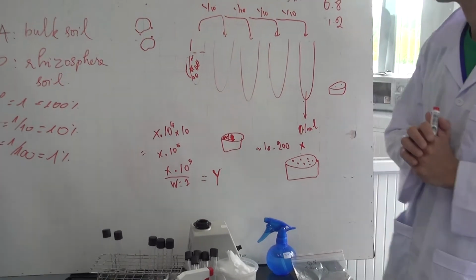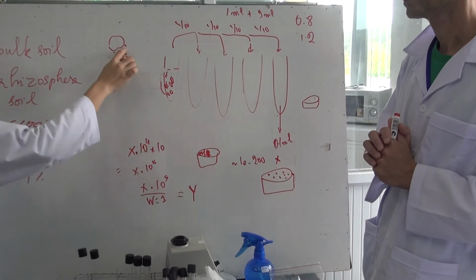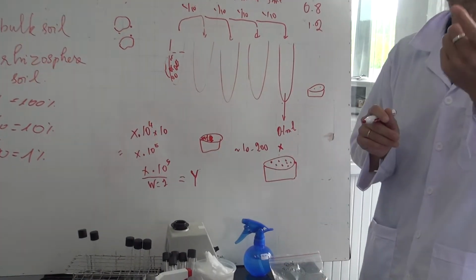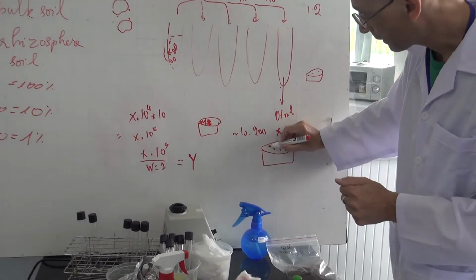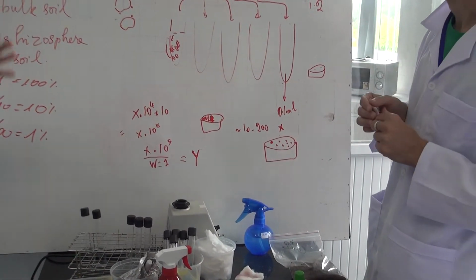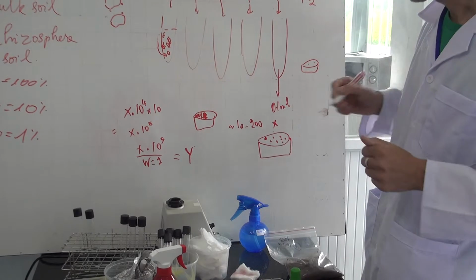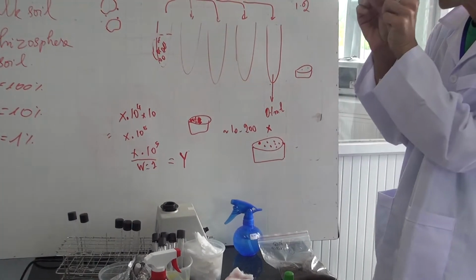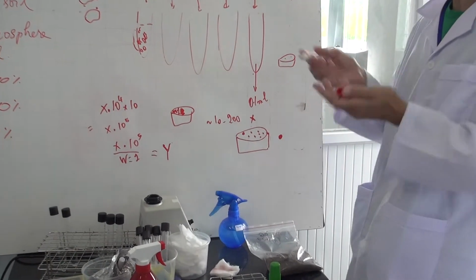Tại vì cái khuẩn lạc ban đầu mình chỉ giả sử là một khuẩn lạc thì có nghĩa là nó bắt nguồn từ một tế bào đơn, chứ không có nghĩa là một cái khuẩn lạc thì sẽ có một tế bào. But in reality, we know that sometimes the colony does not come from one cell, but from a number of cells that stuck together and started to grow in the colony. Nhưng thực tế thì một cái khuẩn lạc như vậy, có thể nó không bắt nguồn từ một tế bào đơn mà nó từ 2 tế bào đơn hoặc nhiều hơn dính với nhau, đó là nó phân chia ra thành khuẩn lạc. Or if you look very, very closely, from two single cells that were so close one to the other, then when they started to develop, their colonies fused, and you don't see the difference.